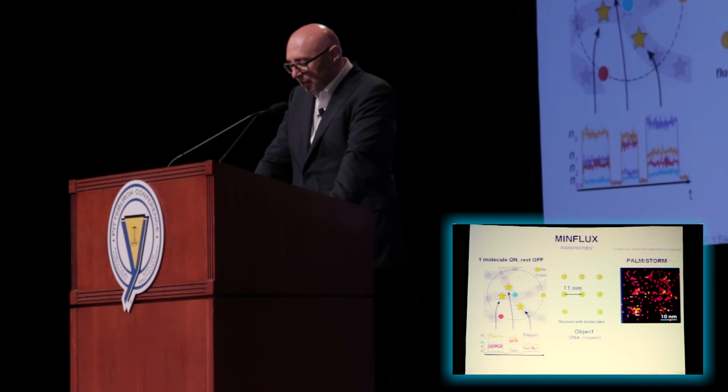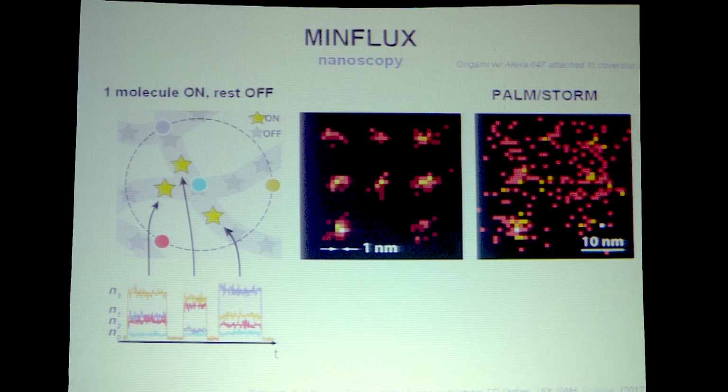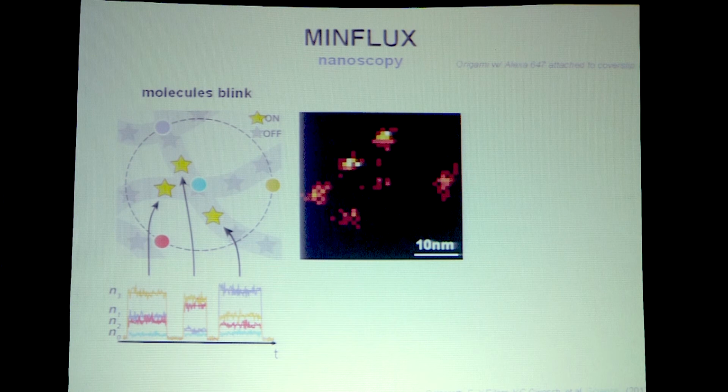And this is the comparison that is experimental. So under realistic conditions, measured experimental data of MINFLUX. And clearly, because we require fewer photons to locate our molecules, we could resolve those molecules very easily with the same number of photons. And so these are other examples, just to show you that we see all kinds of patterns if we try it out in various ways.